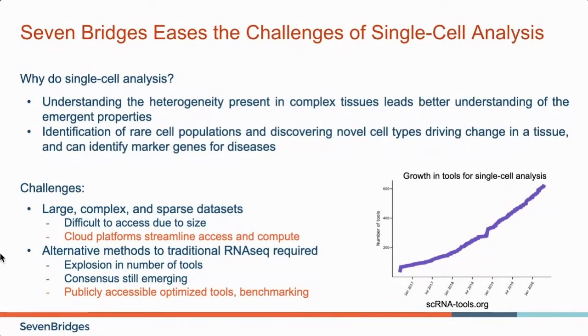And there hasn't quite been a consensus yet in the field on which tools to use. So it can be quite confusing for somebody new to the field to know exactly which tool to use and how to set it up. And this is, again, where the platform can be very helpful. We have publicly accessible apps, so you don't have to build the tool yourself. They're pre-built on the platform for you. And what we're going to do today, actually, is talk through some of the most popular tools that we've added to the platform and do some comparisons between them to make it a little bit more clear which tool might be most helpful for your research needs.